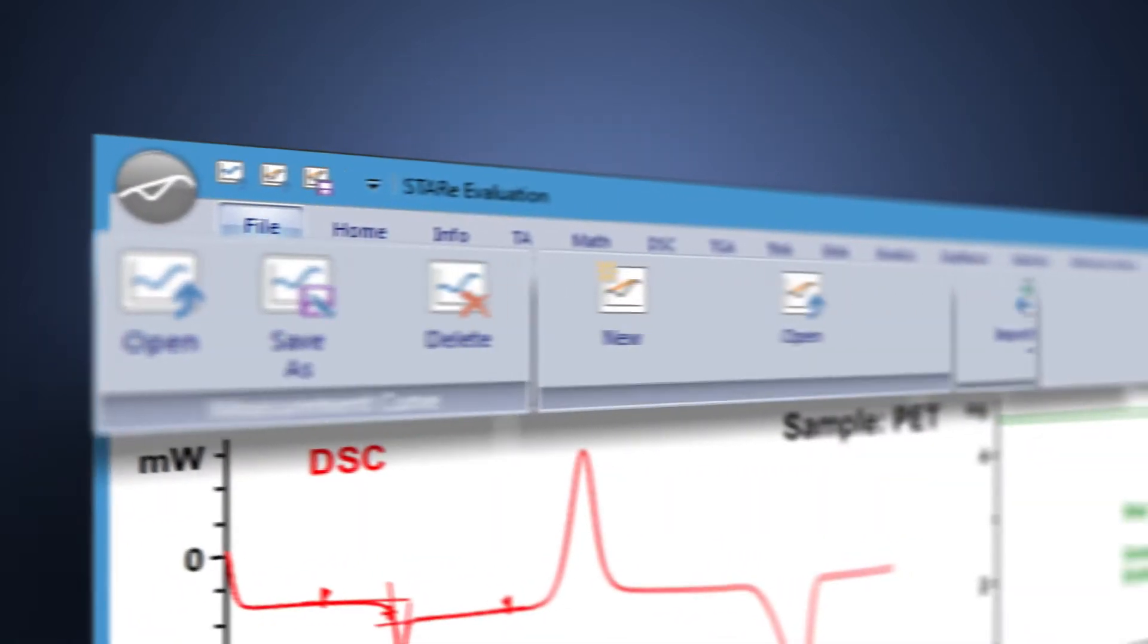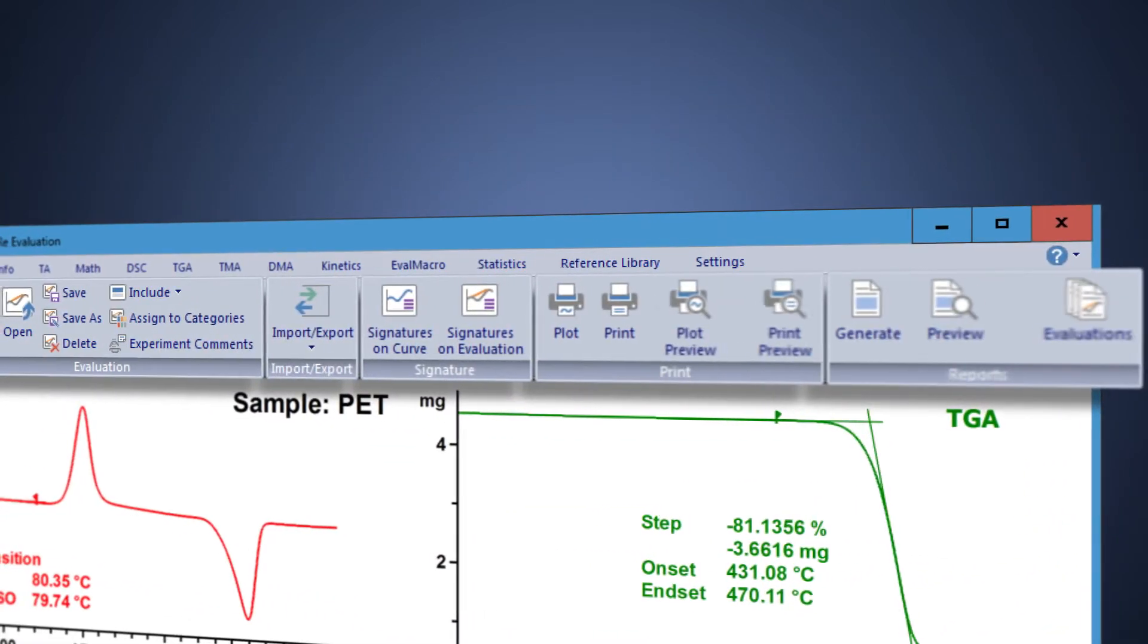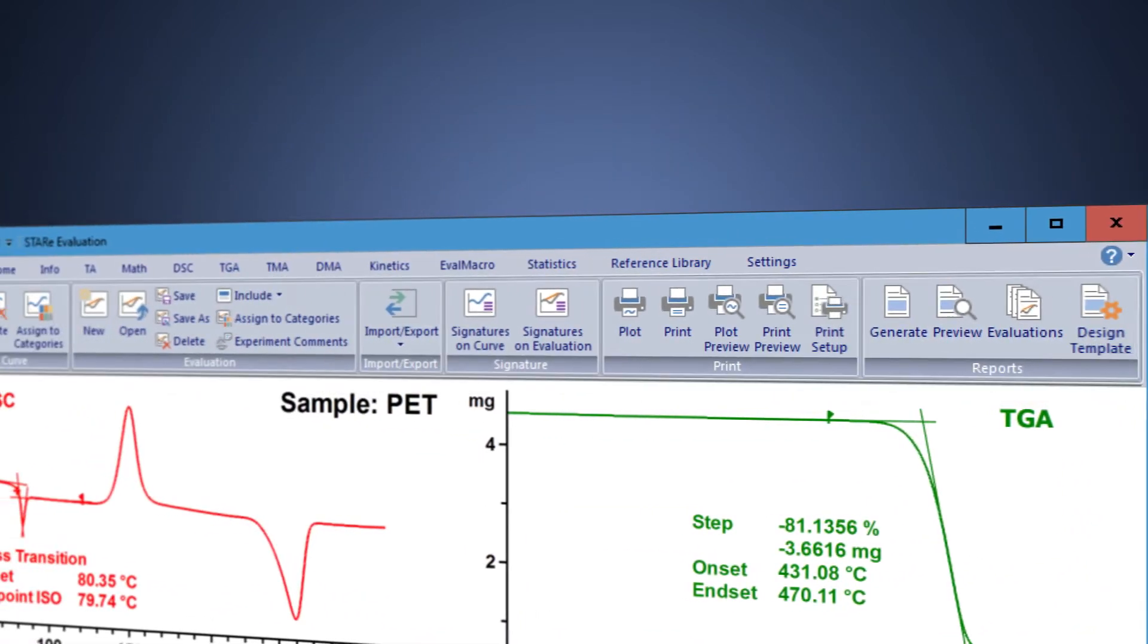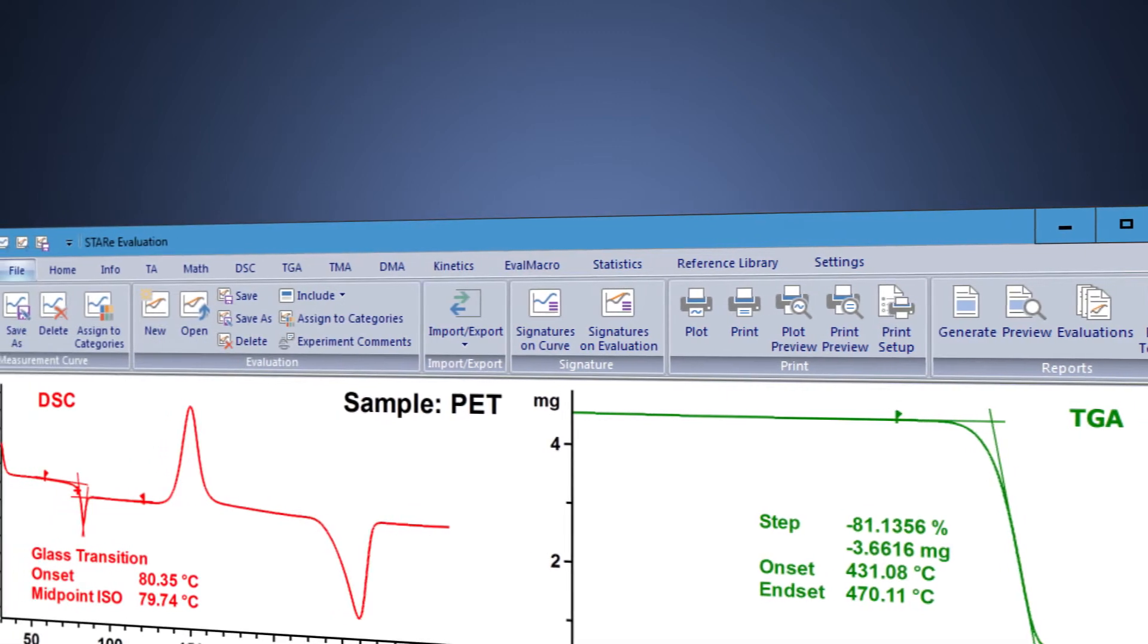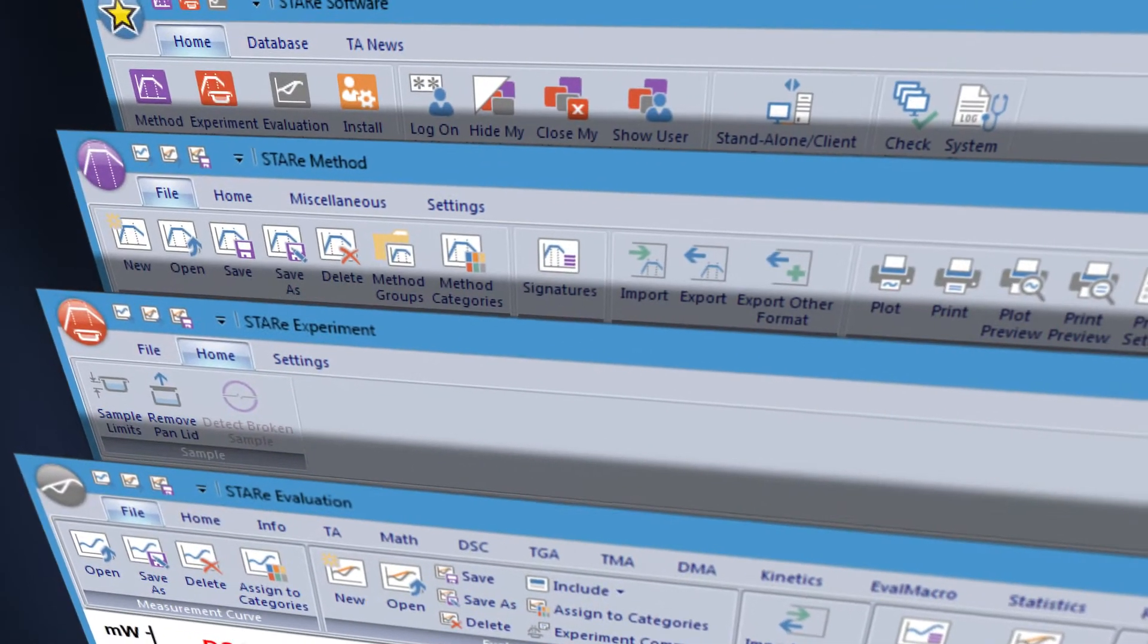Thanks to the familiar ribbon-style user interface, the StarEase software is very intuitive and easy to operate.